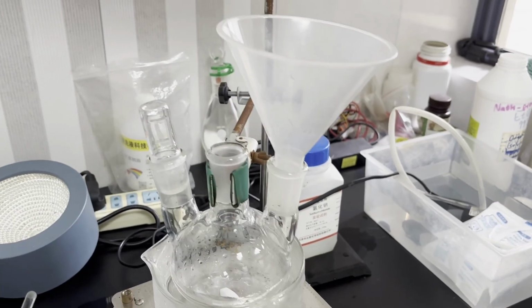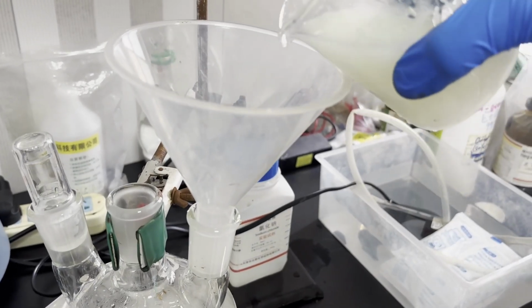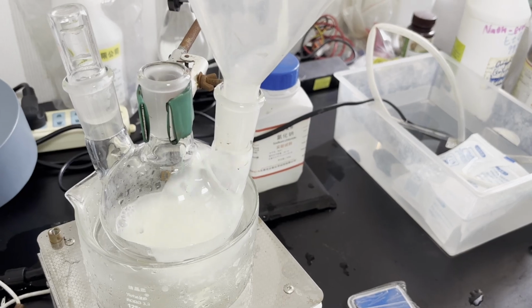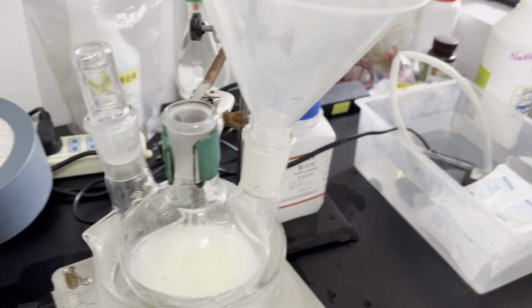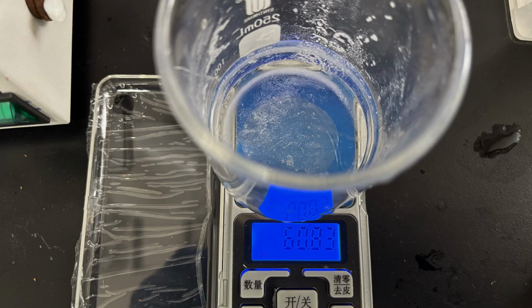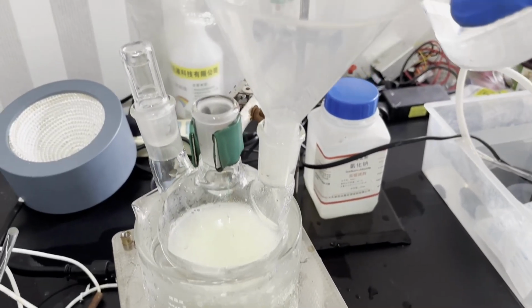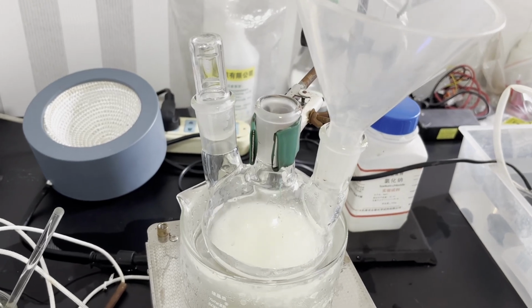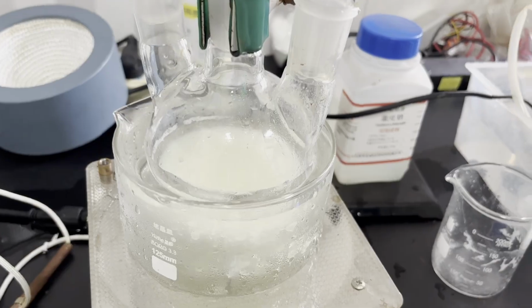A 500 ml flask is placed in an ice water bath, and a solution containing 47.2 grams of calcium nitrite and 100 ml of water is added. Sodium nitrite is no doubt the more popular and commonly available alternative, but all I had on hand was calcium nitrite. 60 grams of N-butanol was then weighed and added to the flask. Although N-butanol is soluble in water to an extent, it is not miscible with the concentrated nitrite solution. Some people prefer other alcohols such as isopropanol or amyl alcohol, and I'll discuss this choice of N-butanol later.